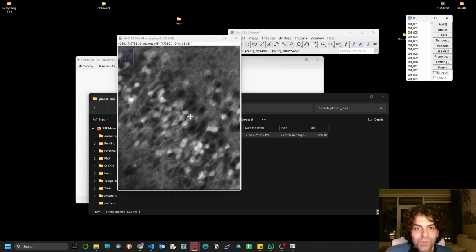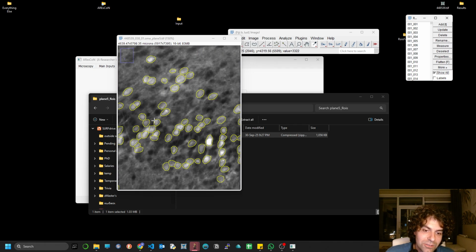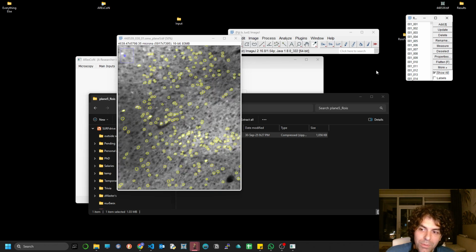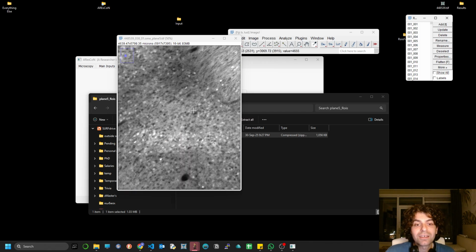And at the same time we want to filter out things that we don't like. So as you can see, Cellpose is quite robust already. I think that's quite apparent already. You can see how well it detects when you have something clear, and when you have something that's not clear, don't worry, because it's going to be captured on another plane.